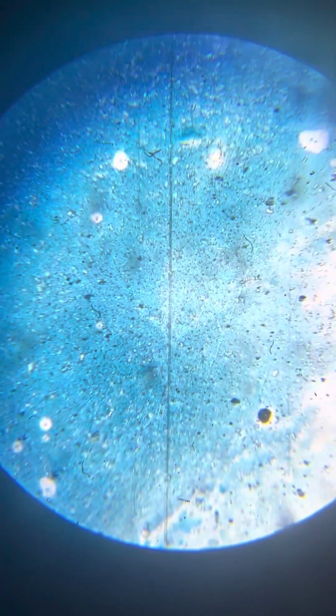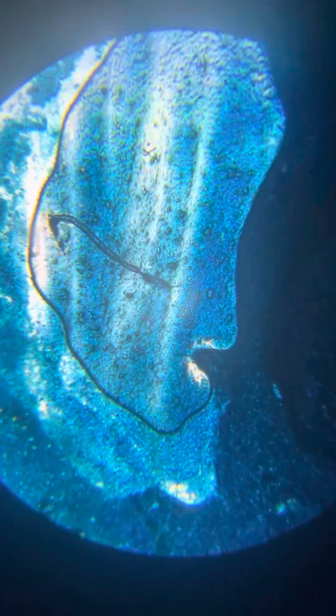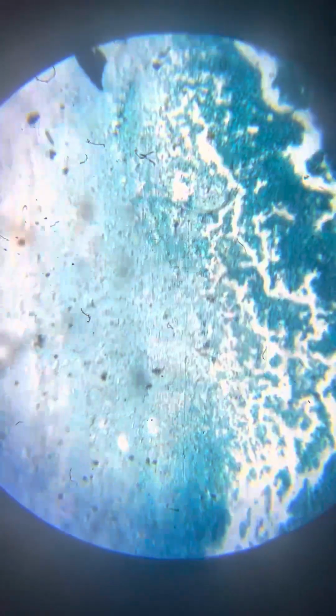I have little idea what we actually see in this slide, so my commentary will be much less verbose than usual, because I honestly don't understand what I'm looking at. I can identify some life form, like this one for certain, and neos here and there, but most of it is just too blue and too chaotic to understand what's actually going on.